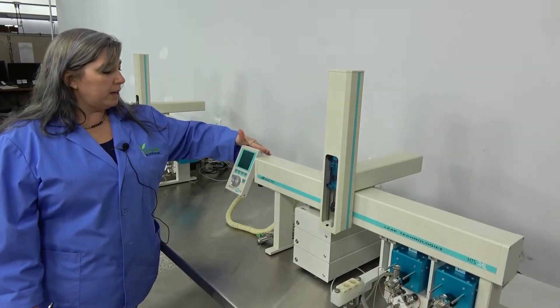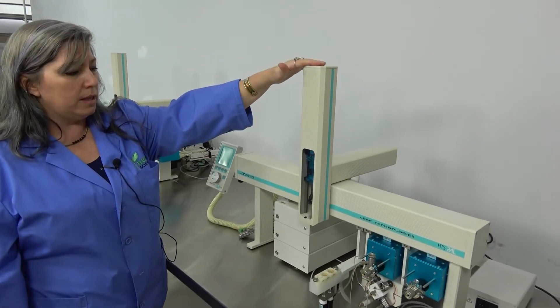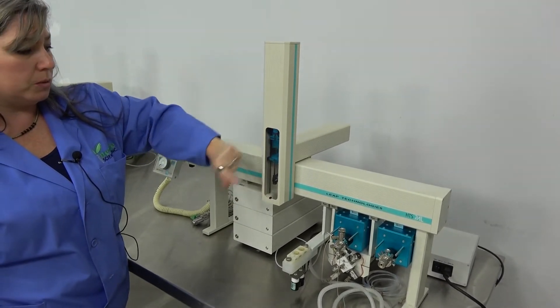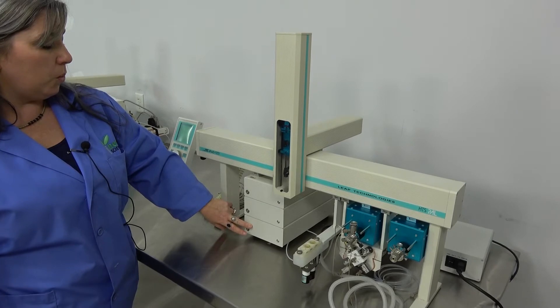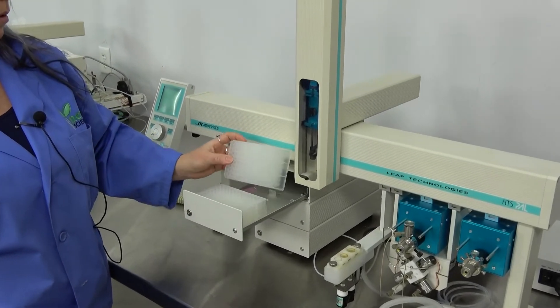Right here we have the pendant control. This is a single head — this is the head right here. This would be where you put in the glass syringe with the replaceable needle or the replaceable syringe. This particular one is set up with drawers where you can put your deep well trays.